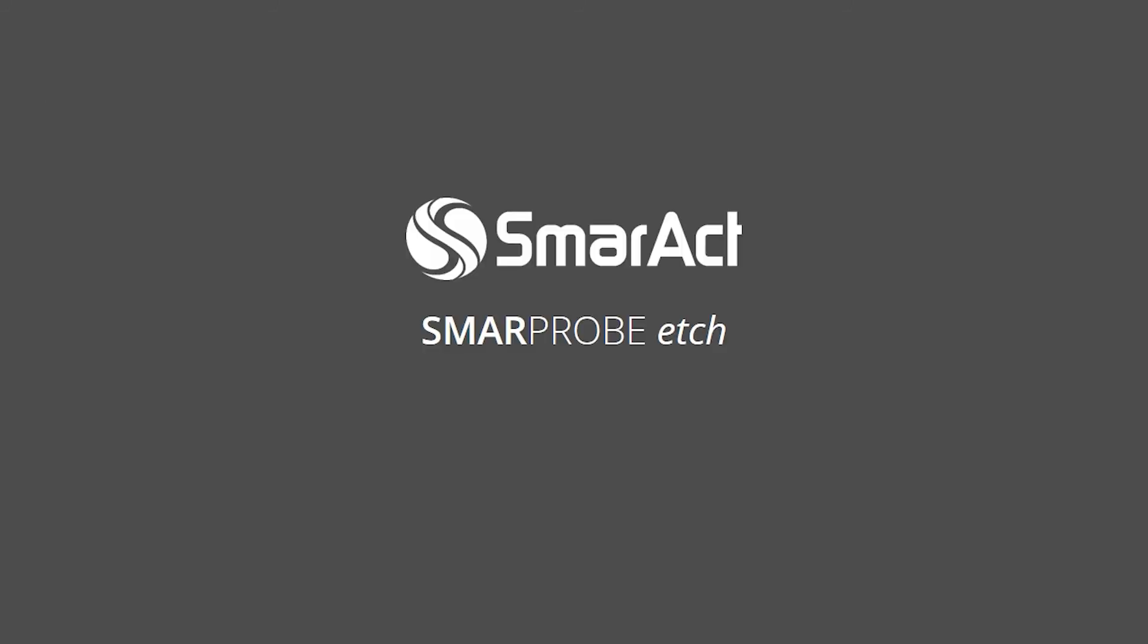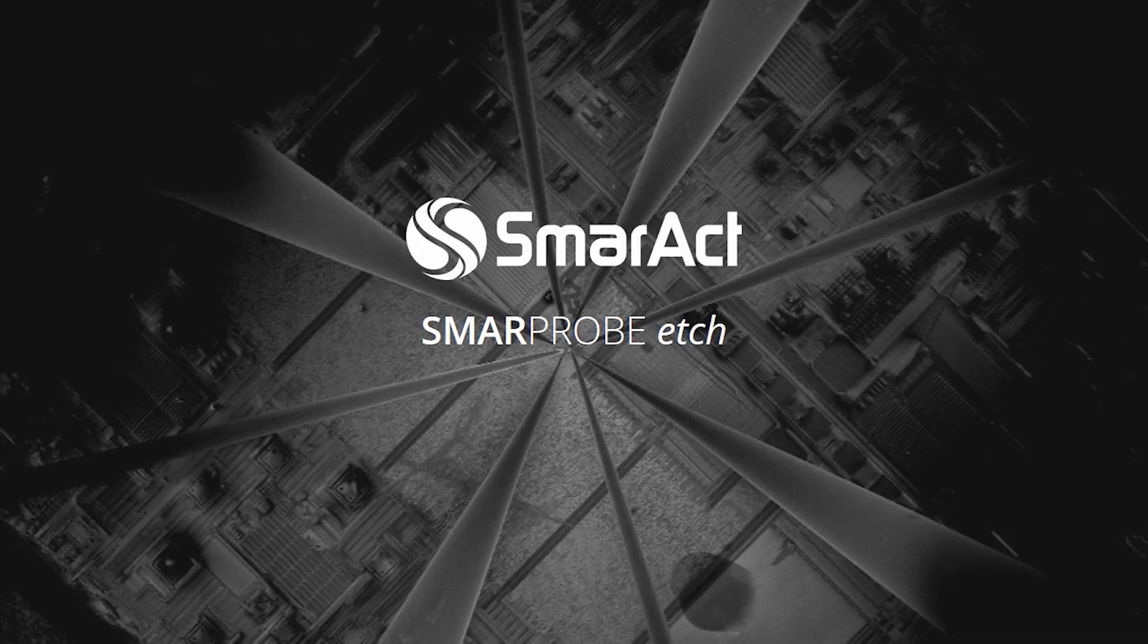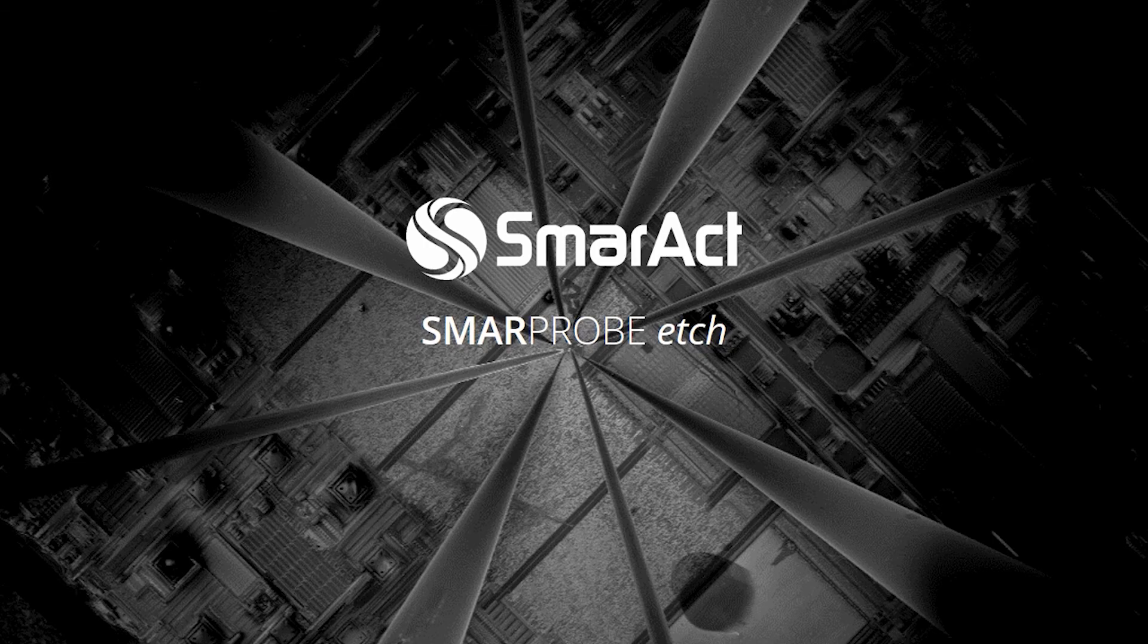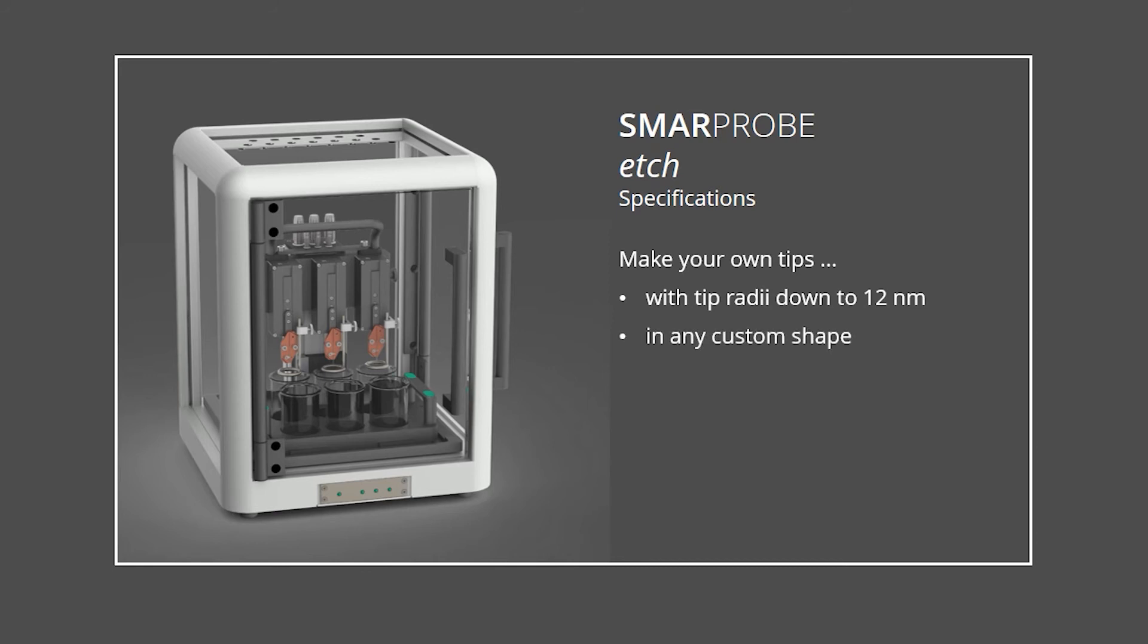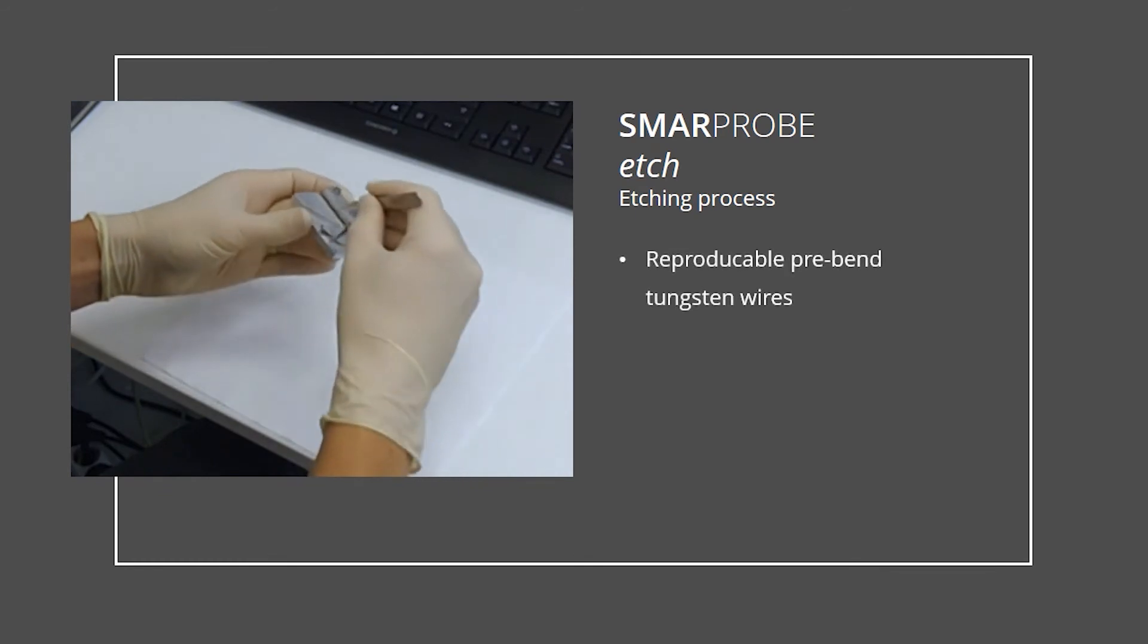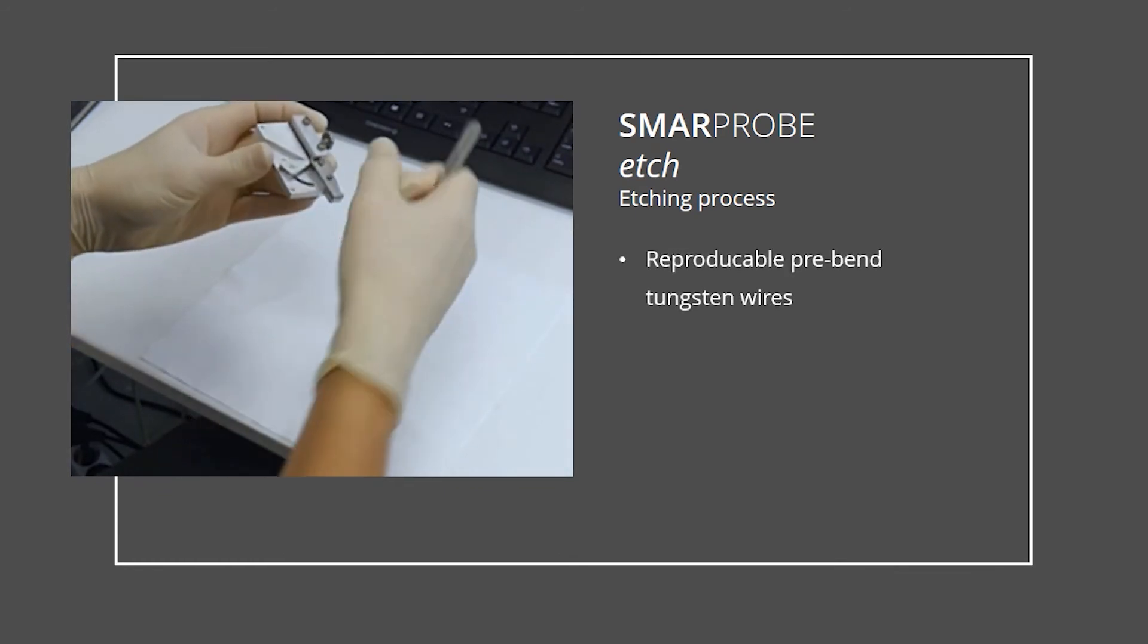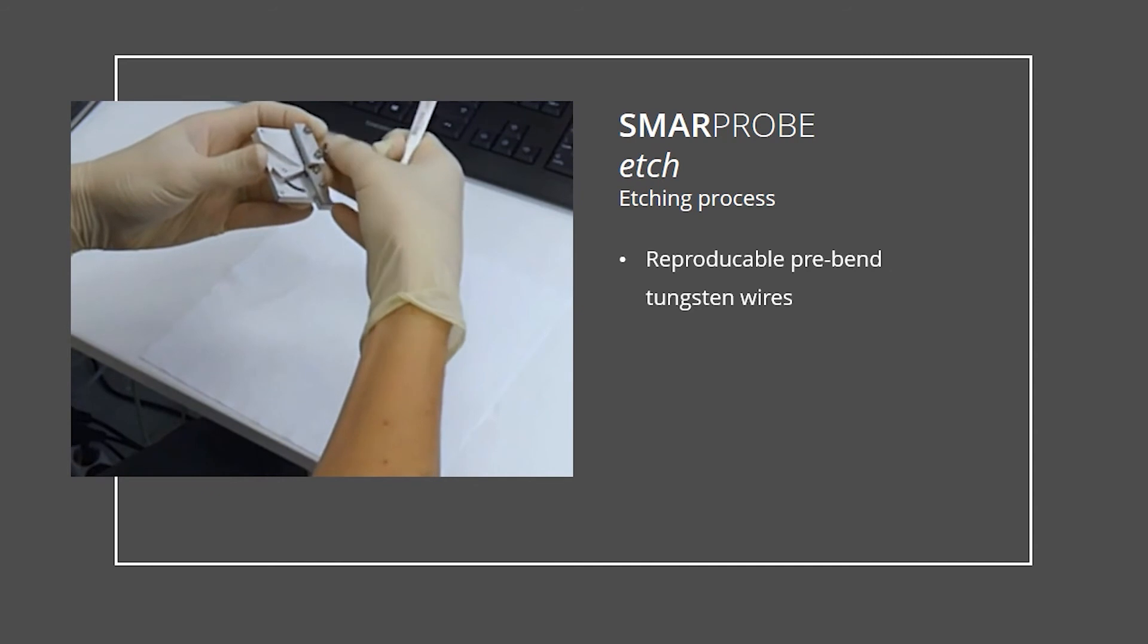The SmarProbe etch makes sure to have the right probe at the right time. The SmarProbe etch produces tips with tip radii down to 12 nanometer in any custom shape. It takes less than 15 minutes to produce these tips at very low costs. The workflow to produce identical tips starts with the process of bending the tungsten wire to the desired angle.